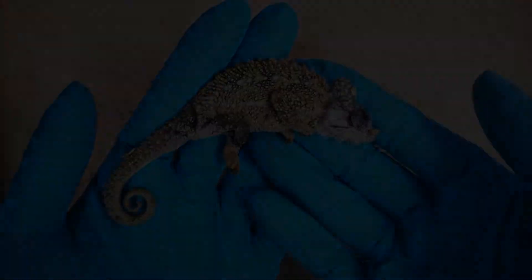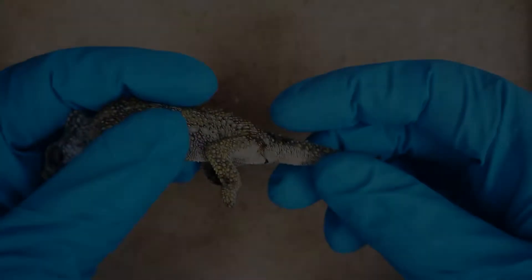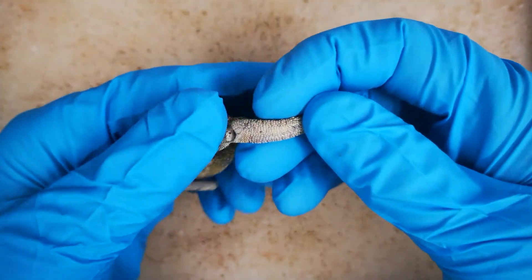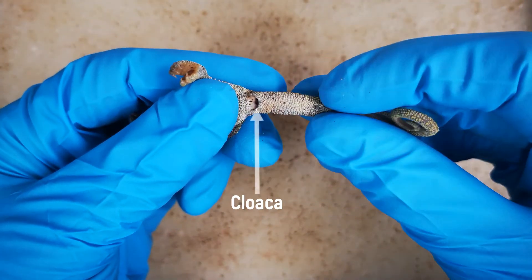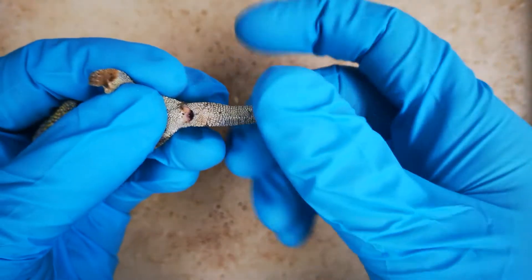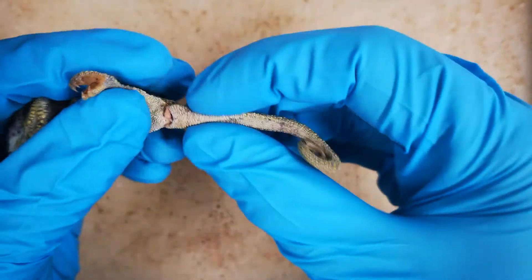To prepare the hemipenis, the deceased reptile is held in one hand, while manipulation and preparation are carried out with the other. For left-handed people, it may be convenient to mirror the approach shown here in right-hand view. First, locate the cloaca and the extent of the hemipenial bulges. Pull gently with the holding hand — here the left hand — to expose the cloaca.